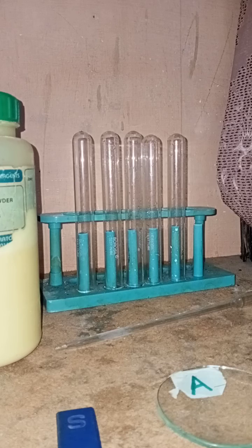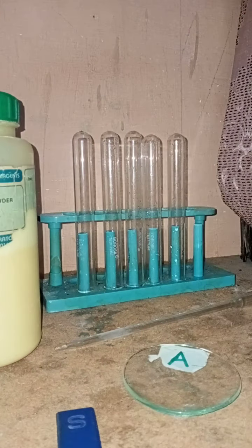Hello dear students, today we want to understand an activity to know the properties or characteristics of the compound and mixture, or the difference between the compound and mixture. The requirements that we have is, we have two watch glass A and watch glass B.